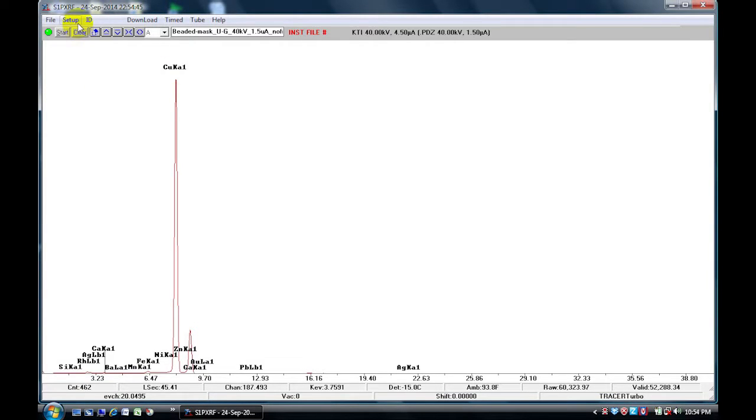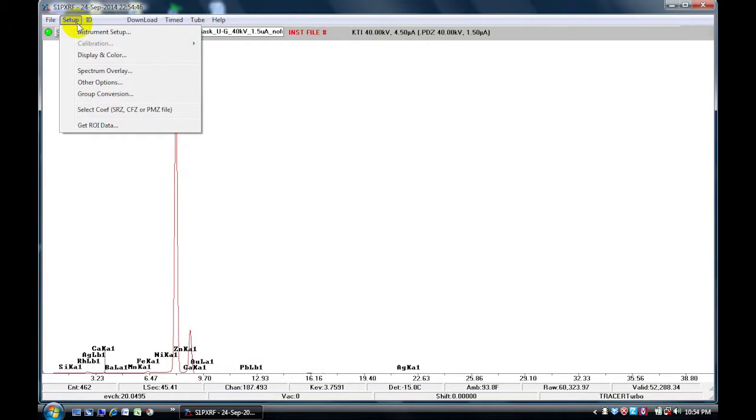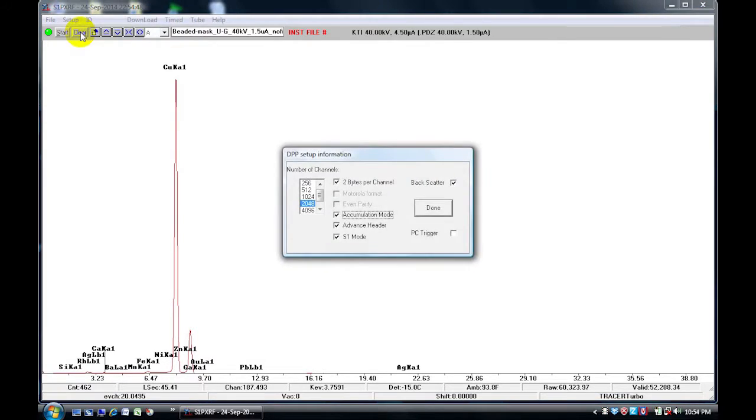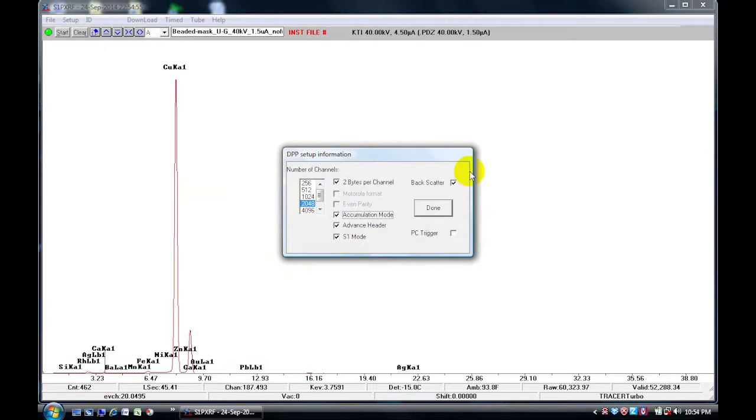Next go to the setup, instrument setup. The number of channels should be at 2048 and the S1 mode should be checked. The backscatter should be unchecked.